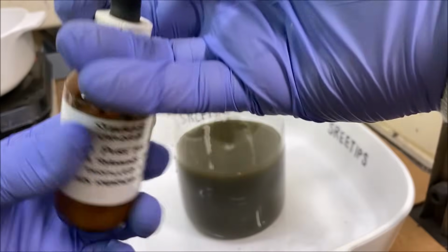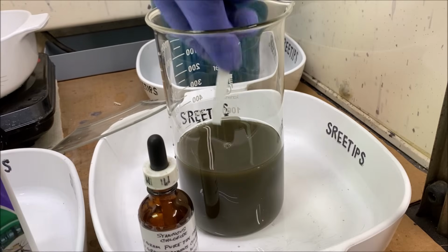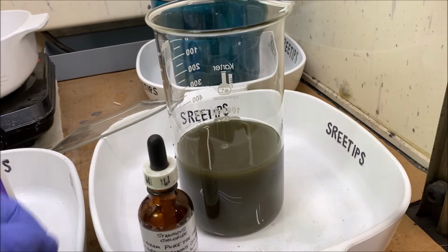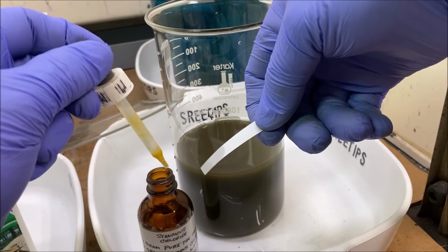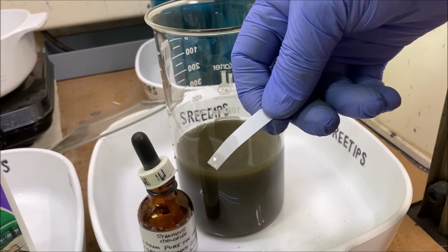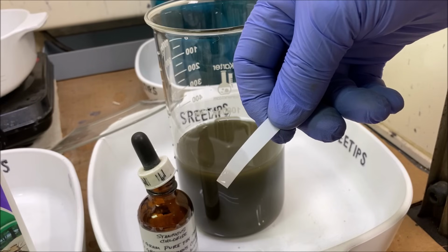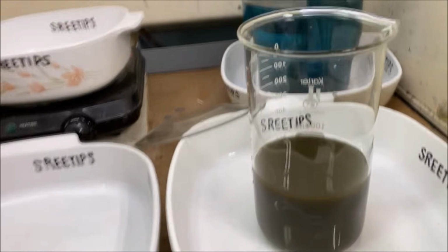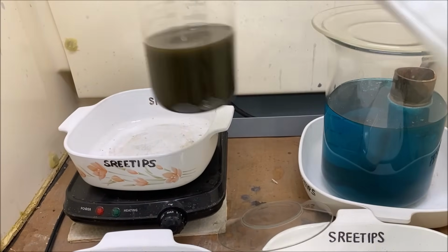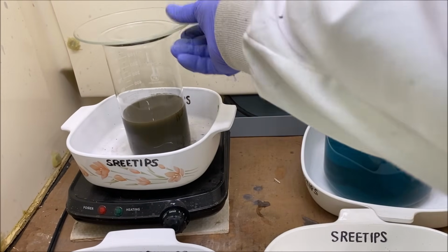Let's go ahead and get another stannous test, just to make sure we've got all the gold dropped out of our solution. Got a little bit of something in there, probably some platinum group metals. Okay, let's put this up on some heat over here. See if we can boil it and get that gold to settle out for us.